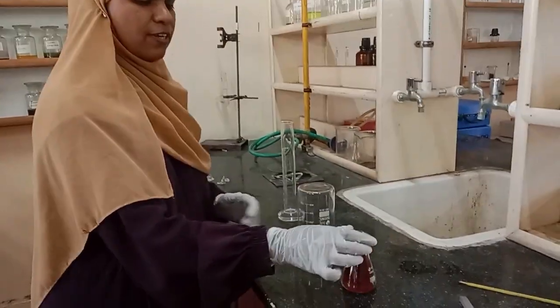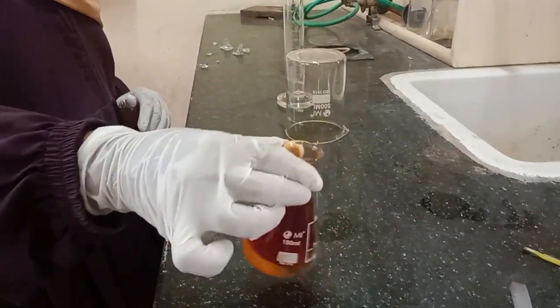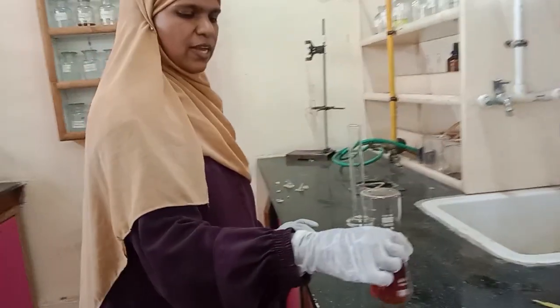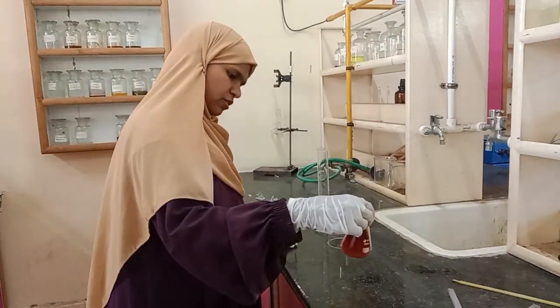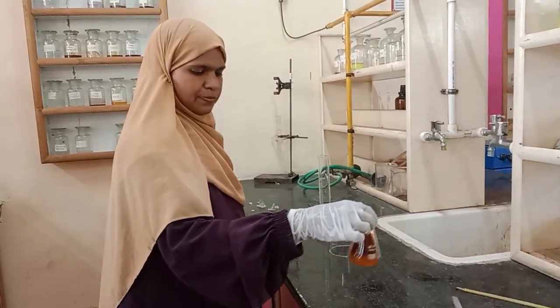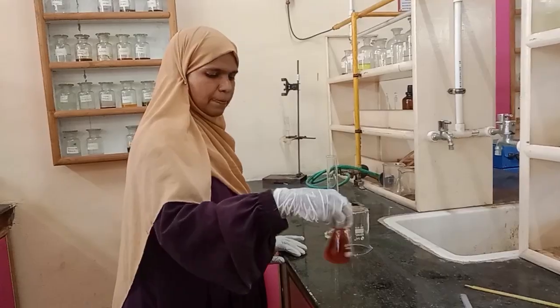After the heating, brown fumes will be observed. This is nitration. After heating, you can stir at room temperature for 1 hour. Then we got the crystals, and pour this solution in ice. You can continually stir for 1 hour.